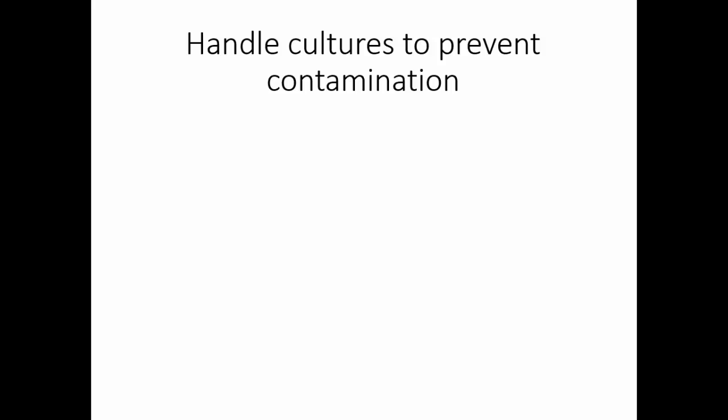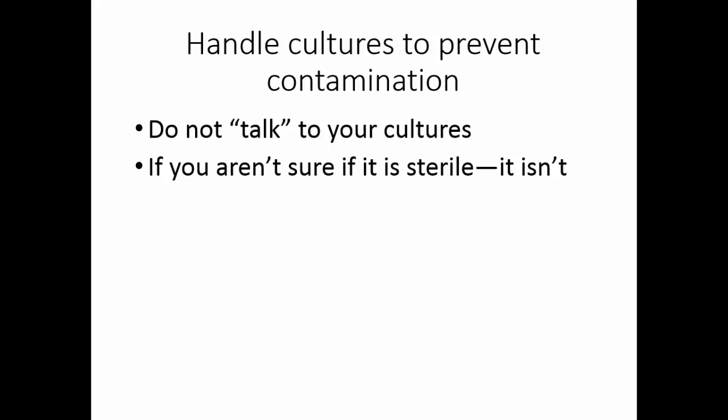You want to handle cultures in order to prevent contamination. You never talk to your cultures. Now, you'll be very chatty in lab and you'll be talking with your lab partner, but when your plates are up or when you're working with your microorganisms, you should be quiet. You should not be talking to your partner. If you're ever not sure if something is sterile, then you should assume that it is not sterile and treat it accordingly. That means you should discard it or start over.